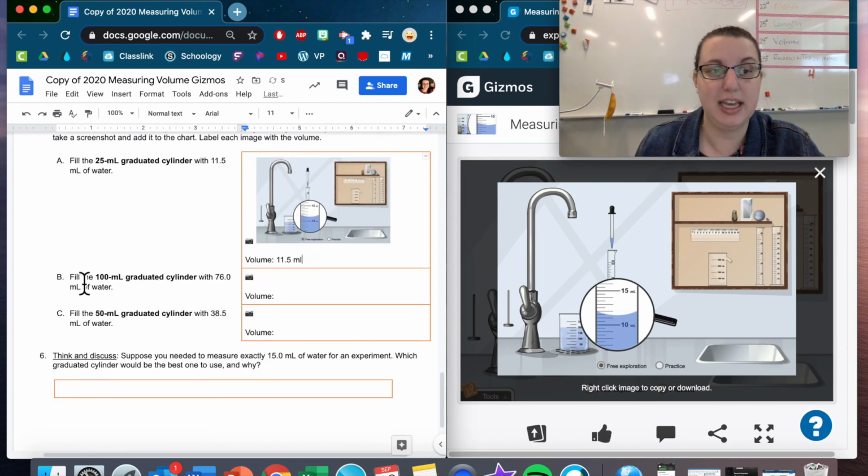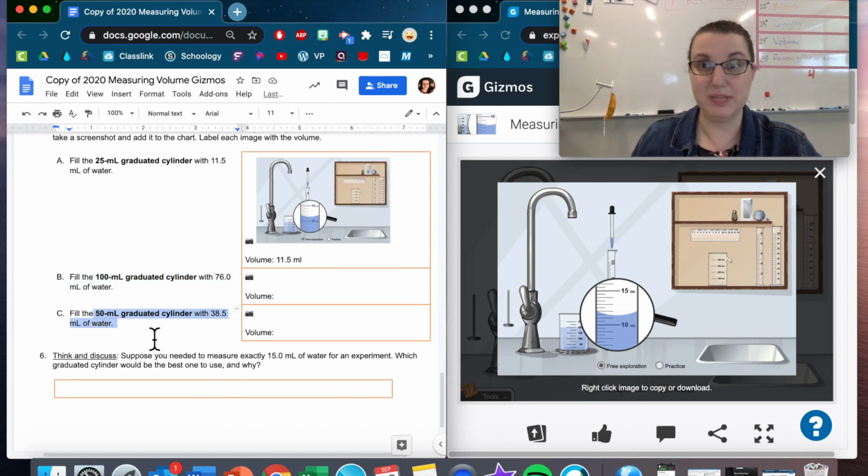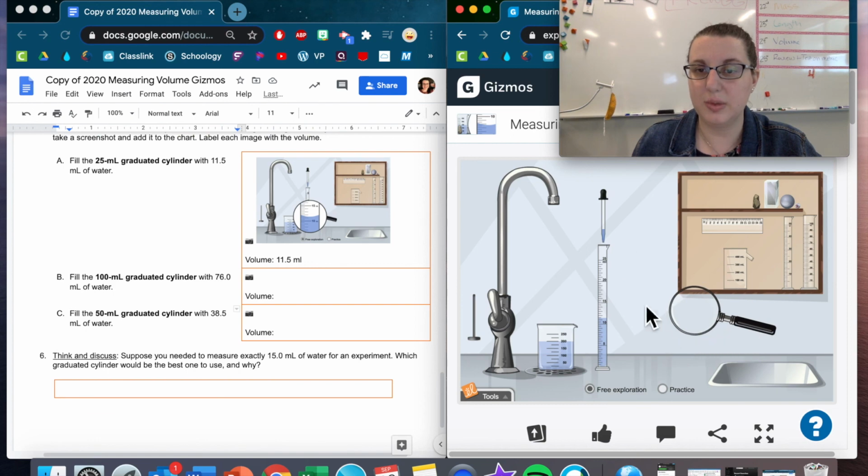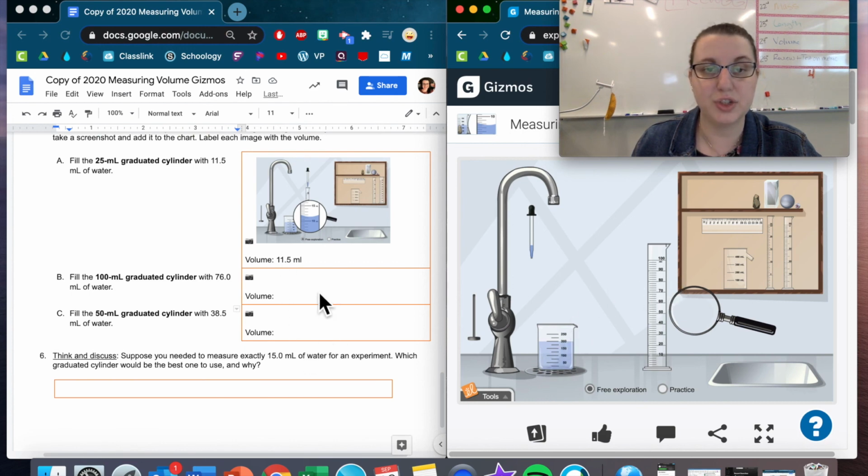All right, and then you're gonna do that same thing. You're gonna take the 100 milliliter graduated cylinder and fill it with 76 milliliters of water, and take the 50 milliliter graduated cylinder and fill it with 38.5 milliliters of water. So back over here, drag this away. You can dump this out. You can put this one back in the cabinet, grab the 100, you know it's 100 because it says 100 over here, and go ahead and fill it up like you did the other one and get your two pictures.